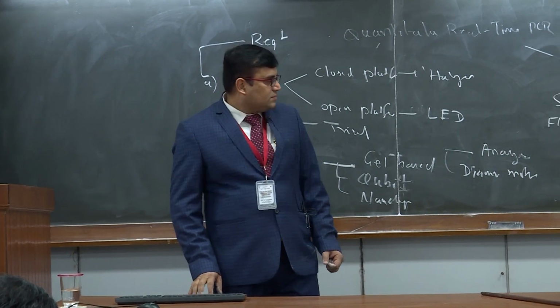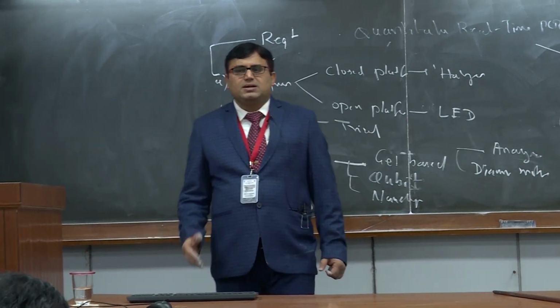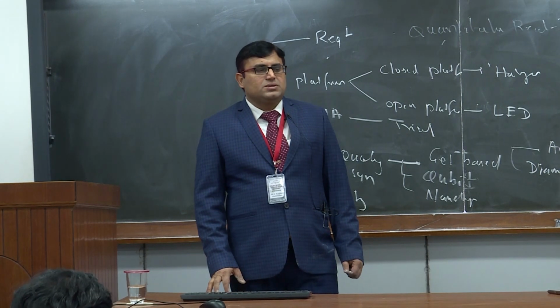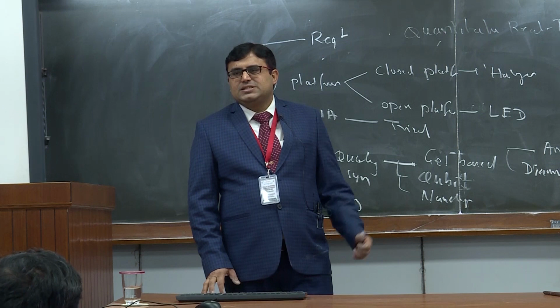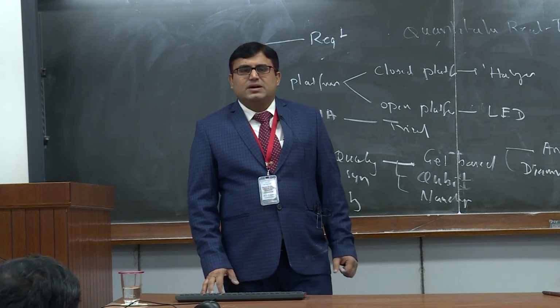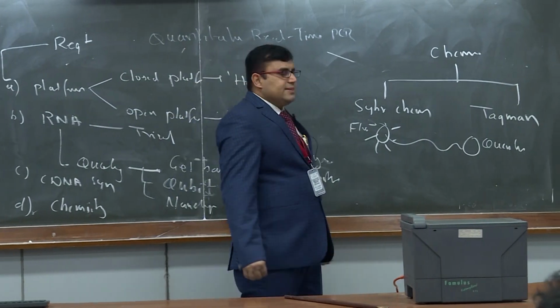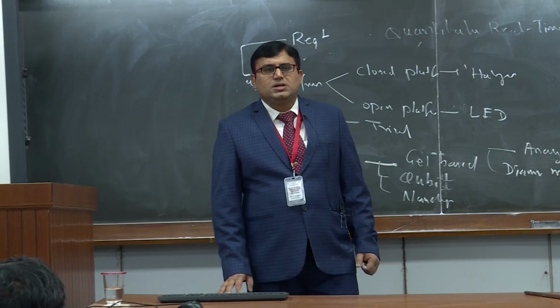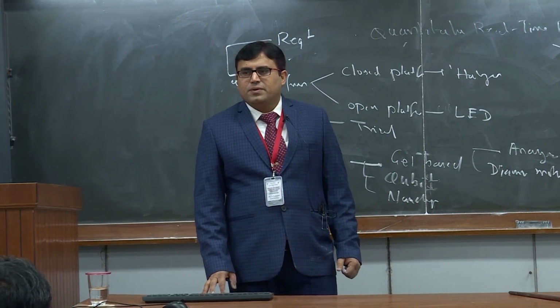Some of the key players for TaqMan and SYBR are Invitrogen, which is proprietary of Thermo Fisher Scientific. This is a very good company, and they have expertise in designing this. Then you have Sigma, which also has expertise, and they have their own SYBR product, which is very cheap as compared to others. So you can purchase and use it.